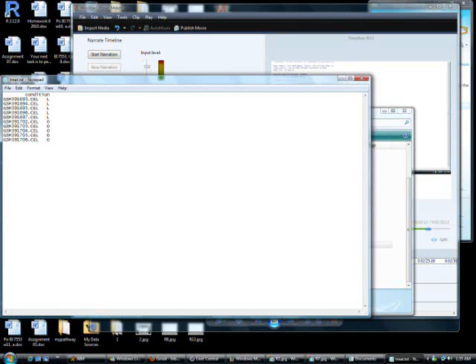So the covdesc file that we just pulled into the variable pd, phenotype data, looks like this. There's two columns. The first row in the first column is blank. The second column, the first row, has the phenotype. So I just said condition.